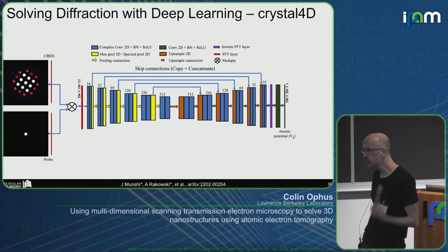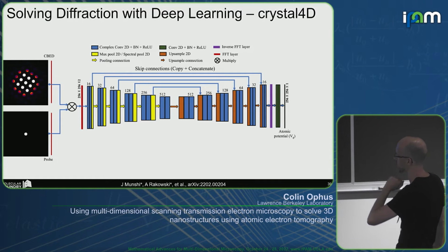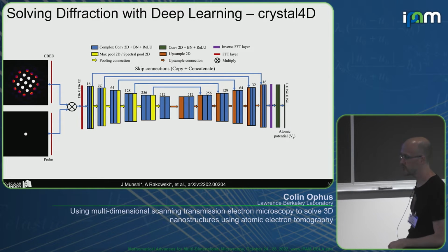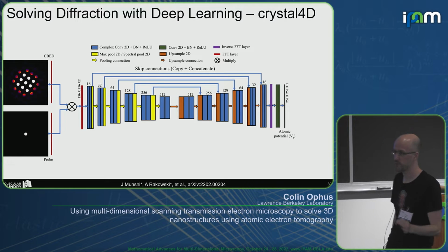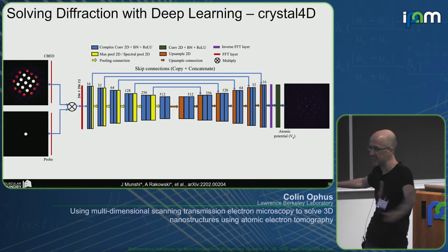Now, this is because pooling of information over large distances is much, much more efficient in Fourier space. You pretty much start getting benefits even in the first couple layers here, let alone for a deeper network like the UNet here. And then the other thing we do is every pixel has a complex value in Fourier space and a complex activation layer. So we're using complex ReLU or whatever it's called now. I don't think that's the ideal activation layer, but it works much, much better than using a scalar value for each pixel. And then, as I mentioned, the result is this 2D crystal field sliced in 2D.